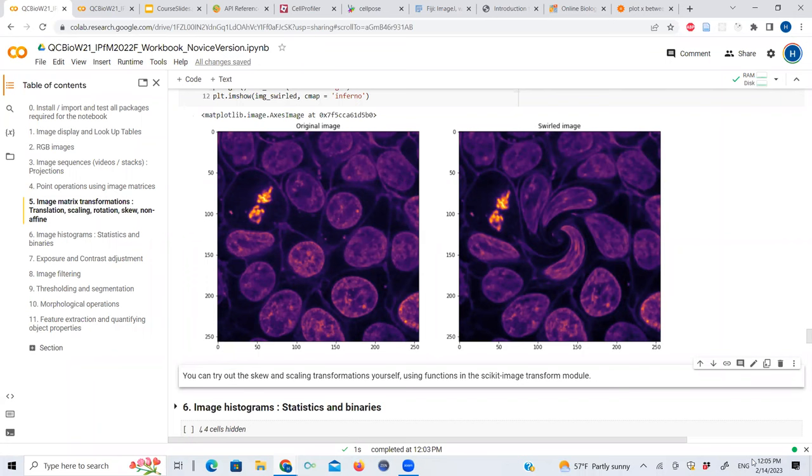I guess I was wondering on ImageJ, I've noticed that for the projections, it also gives us, I believe, the standard deviation, like if you want to get the standard deviation of the pixel intensity and also the median, right? So I wanted to ask you, when would you use one over the other? So standard deviation versus the mean intensity, right?